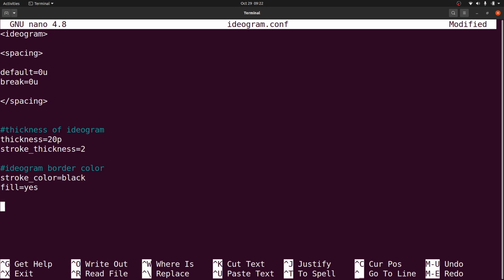So that's it. Now let's look at something fractional: the radius position of the chromosome ideogram. I'll say radius equals 0.85.